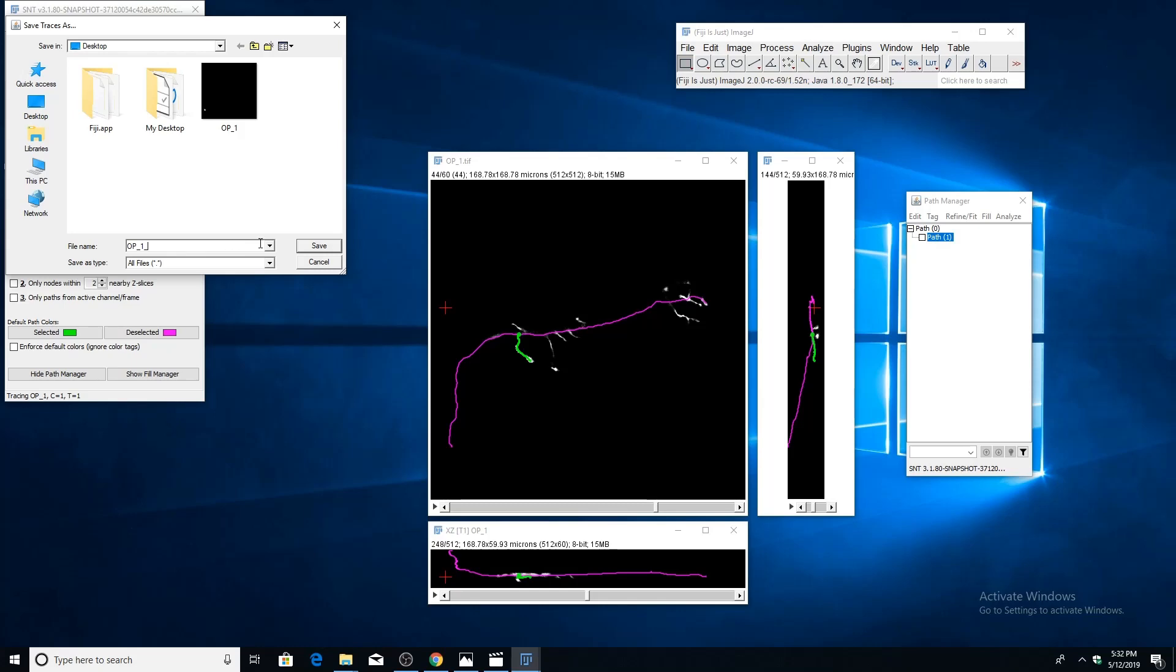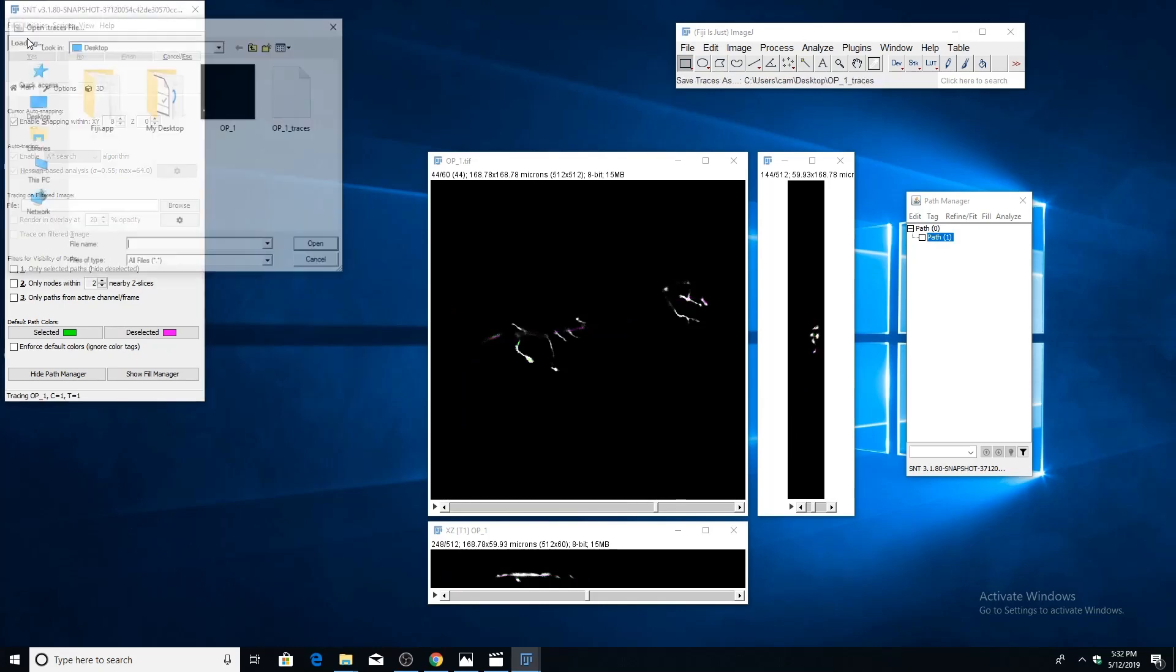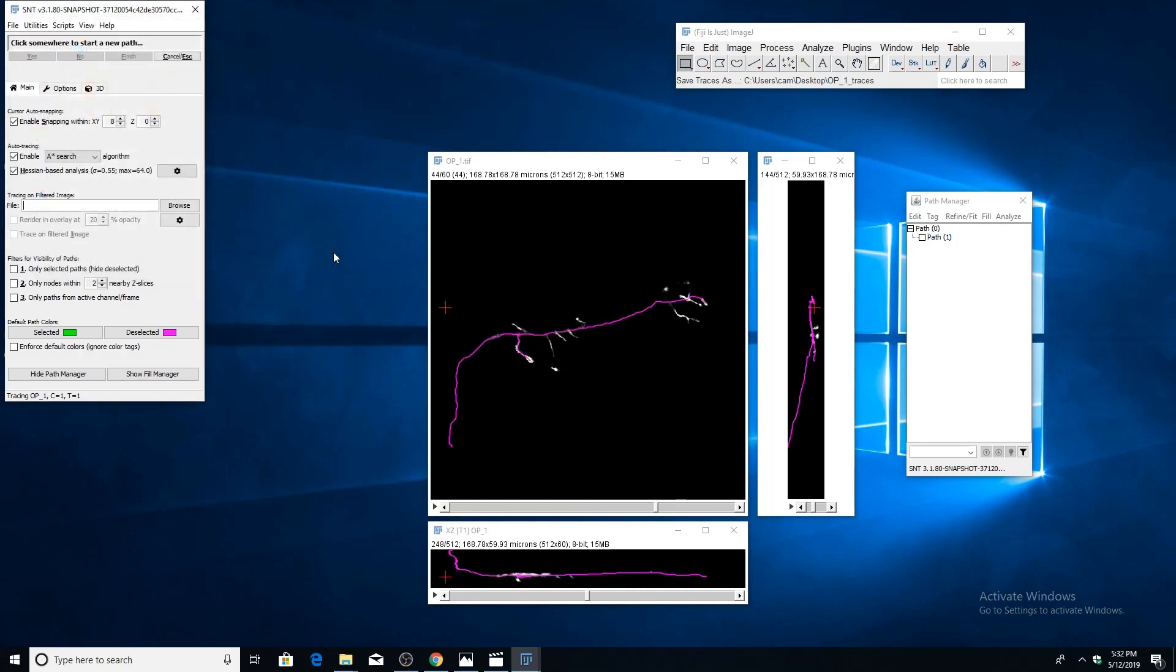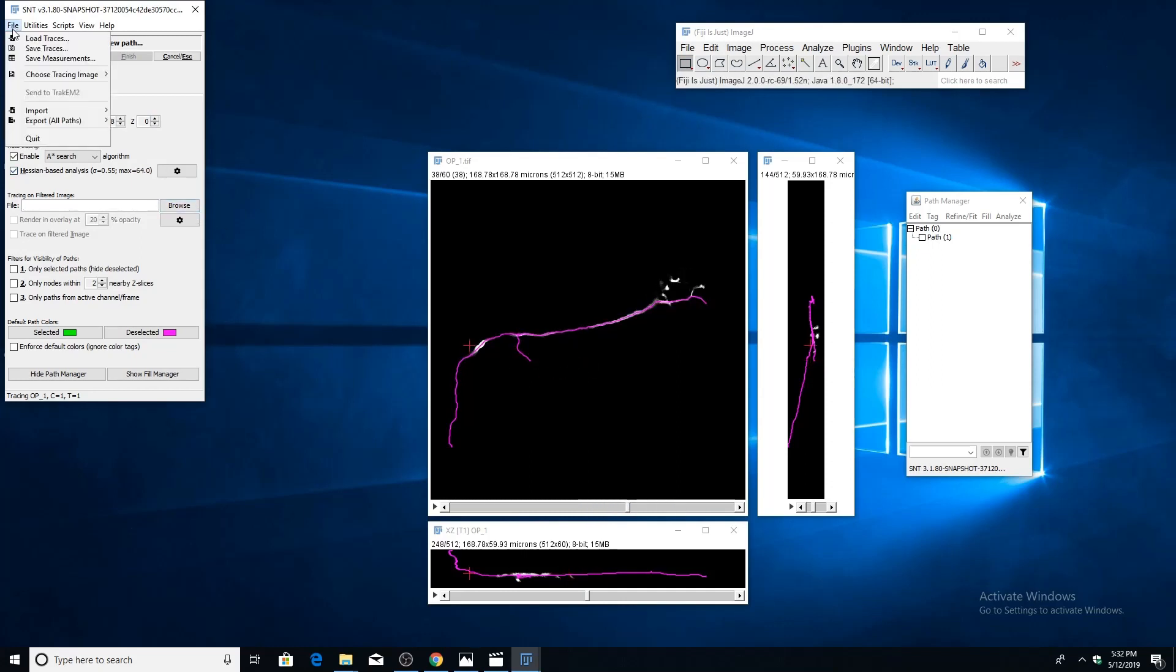I'll show you how that works. Just go to load traces, and you'll see that it added traces to the file name, so you can just load it back in. You'll see this is our reconstruction. There's also an option to export the reconstruction as an SWC, which is a widely used format for representing neuronal structures.